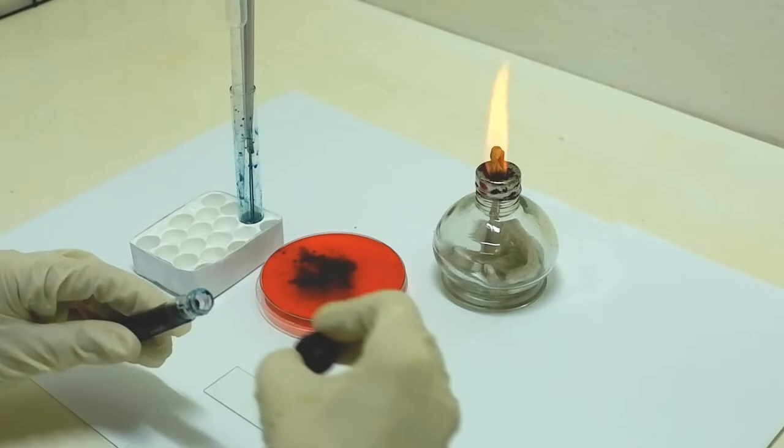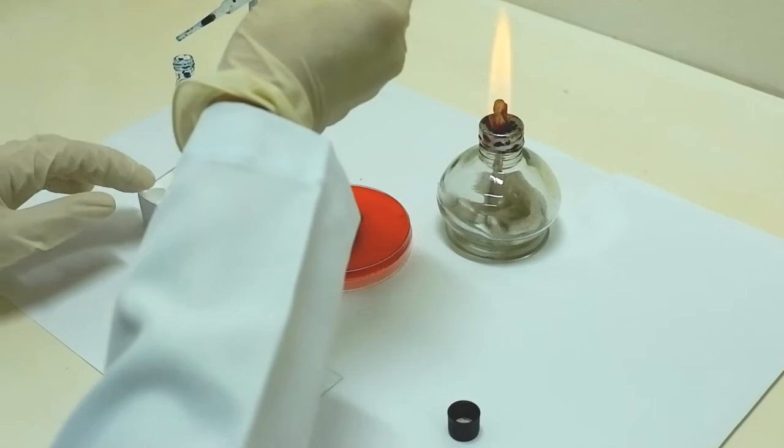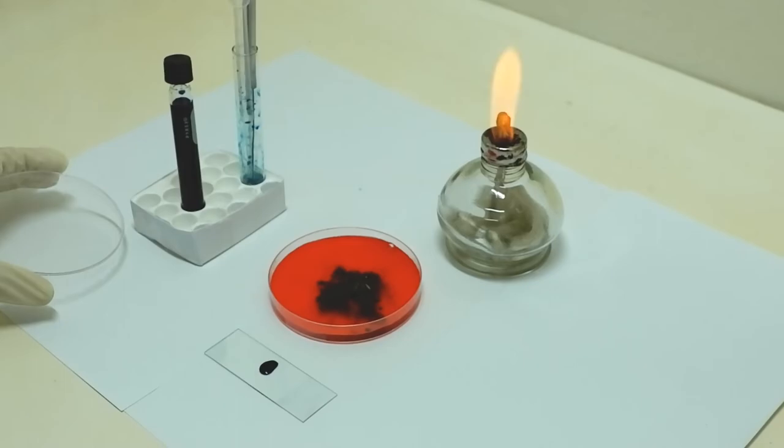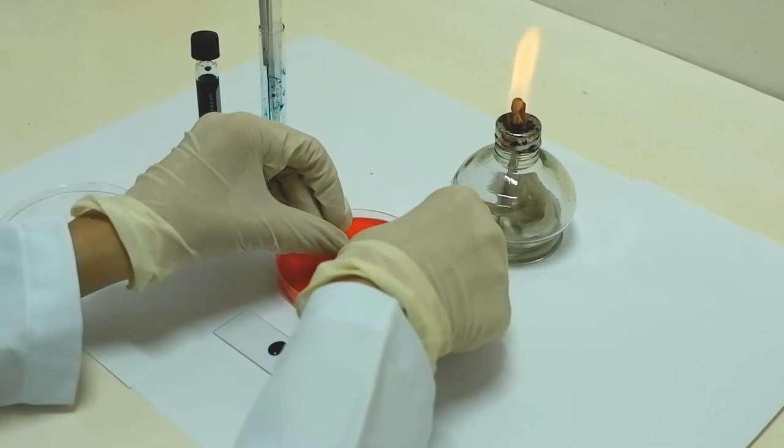The first part of the procedure is to prepare a sterile slide with a drop of your lacto phenol cotton blue stain. Now with your two inch piece of transparent cellophane tape, hold it between your fingers with the sticky side out.